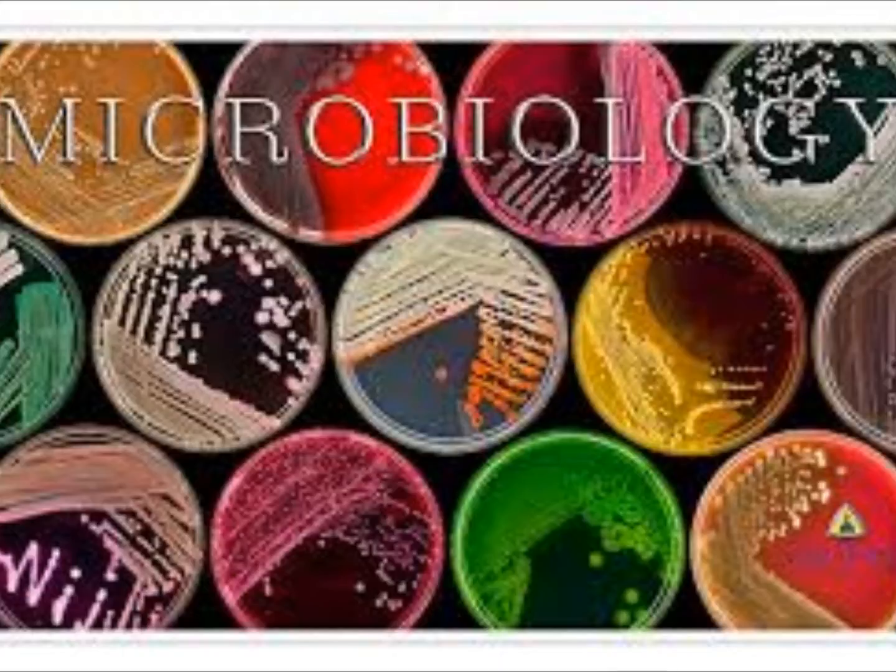Which one is it? This one is number staph epi. I'll do it. I'm gonna pass that over to them. Let me see this, yours. What was your guys? Klebsiella pneumoniae, did you guys already do Klebsiella pneumoniae? No. Here you go.